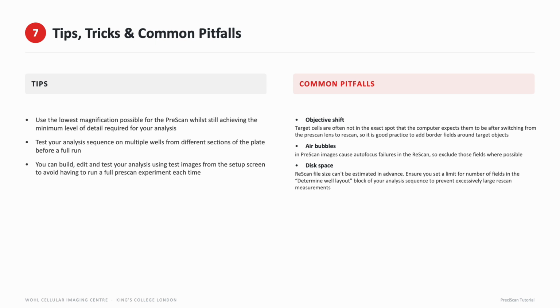It's often a good idea with your rescan to add border fields around your field and also to add a 3D Z stack in case there's a bit of focal plane shift in between the two lenses. Air bubbles. If there's air bubbles in the pre-scan images, you get autofocus failures in the rescan. I mean, air bubbles are a problem for autofocus regardless, so just do your best to avoid air bubbles. If you're using a water lens, make sure that you flush the lenses before you begin the whole experiment to minimize the chance of there being air bubbles in there.